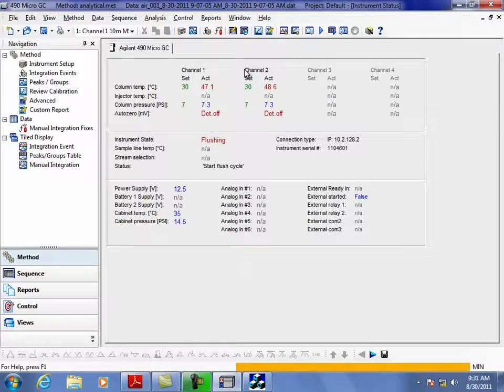From a biological fermentation application, we want to use mil scale, maybe 10 mil. 10 mil is going to be very hard to do. I mean, think about the loop on the injector. It's very small, 1 mil. Actually, I think it's smaller than that. I can't remember my numbers right now. But there's all the tubing upstream of it. And what you want to do is overfill that loop at least 5 times. Well, there's your 10 mils gone quickly.